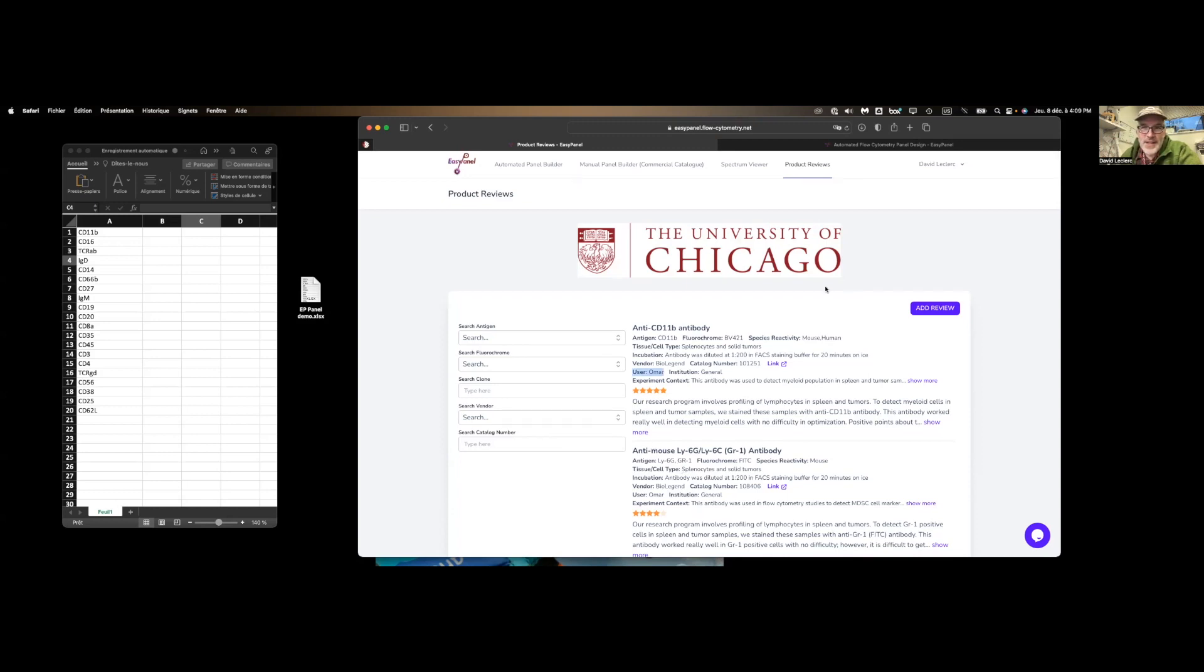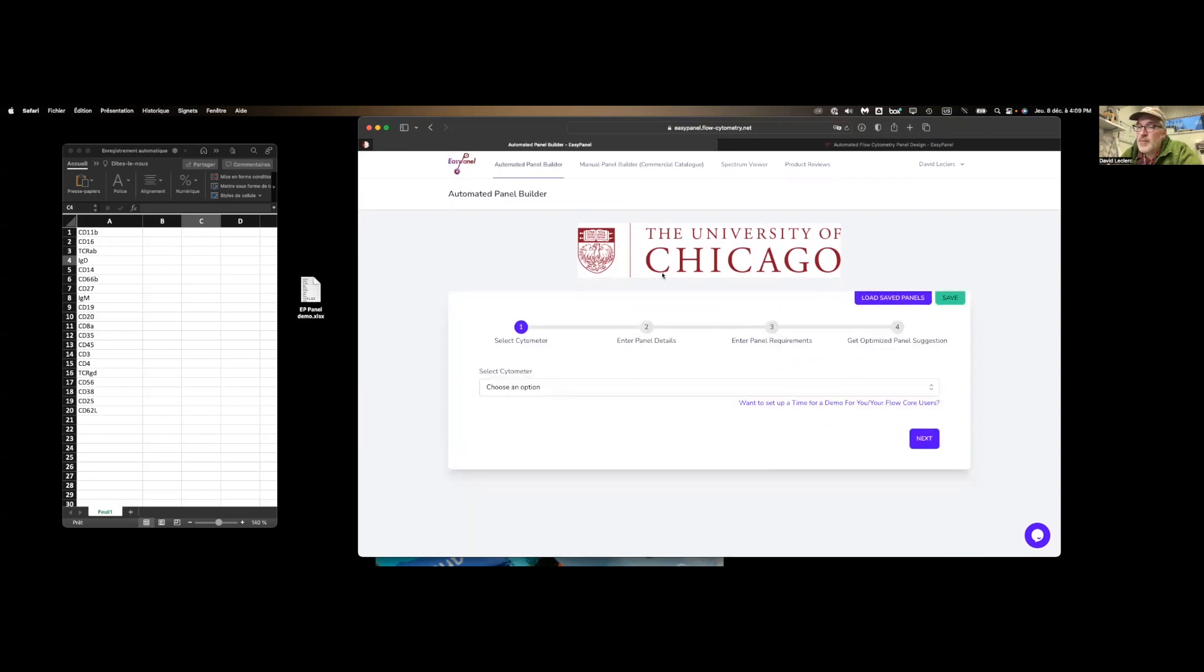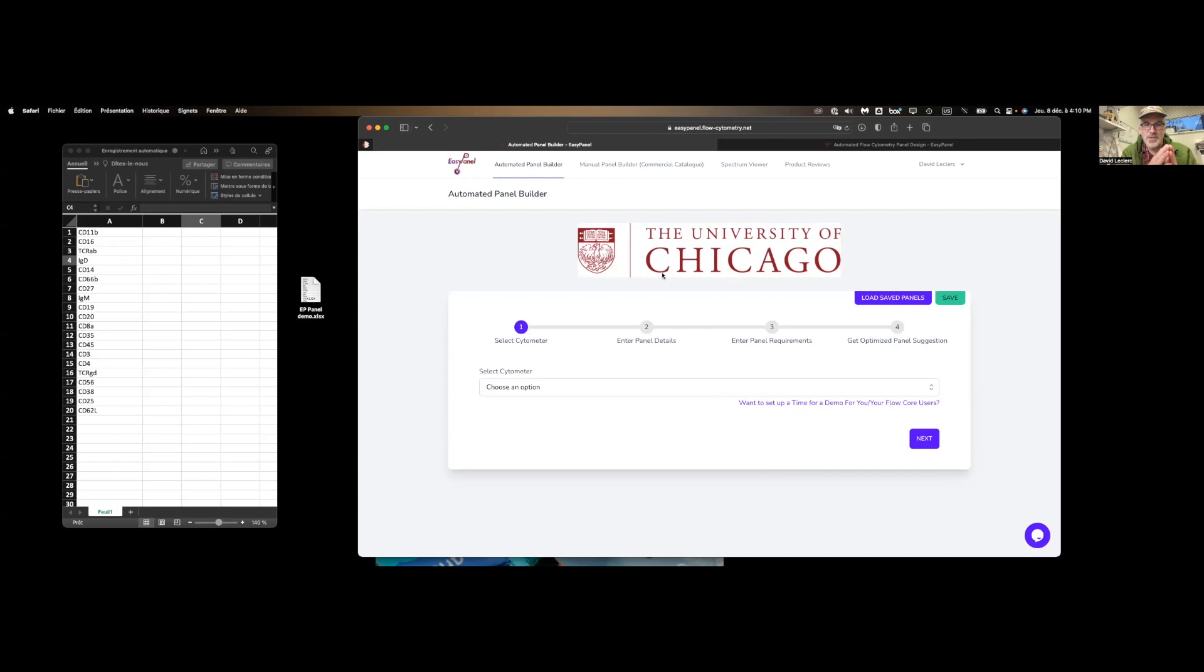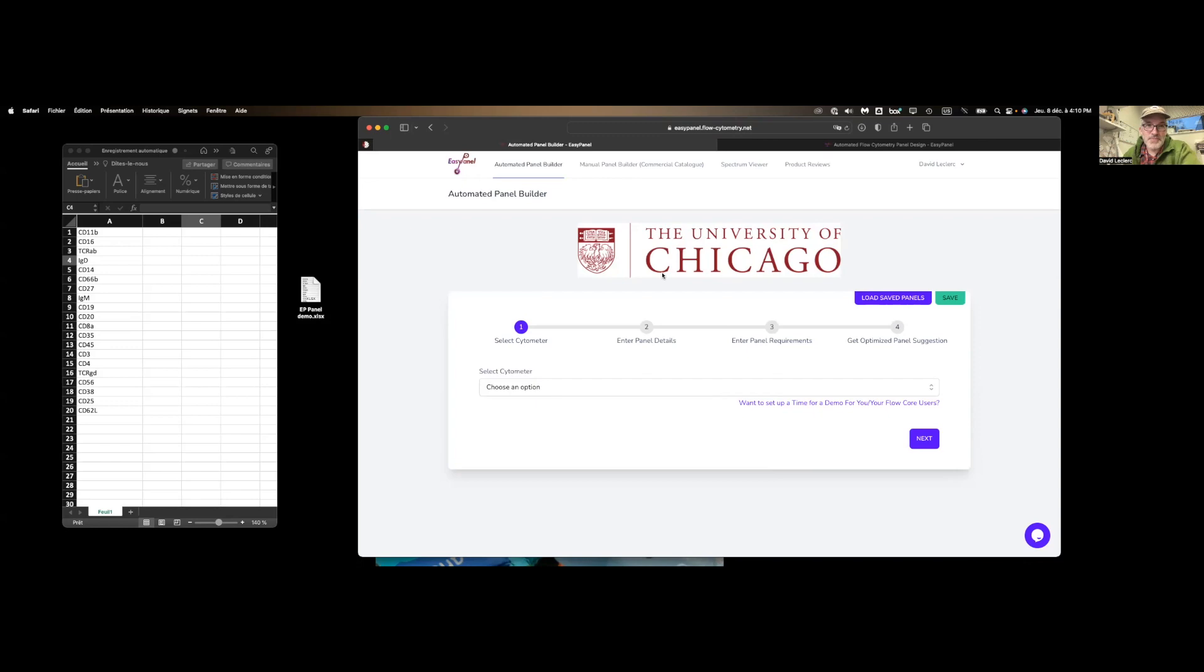Pretty exciting, makes the panel design incredibly quick and easy. Even if you don't end up with this particular panel that is suggested, it does the bulk of the work for you. And so it's going to be pretty fun to work with this tool going forward. Let us know if you have any questions. All right, thanks. I'll talk to you later. Bye.